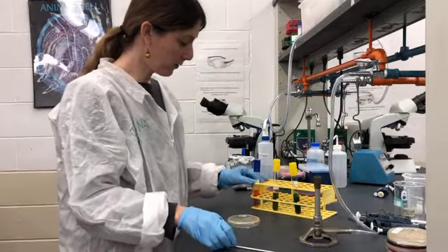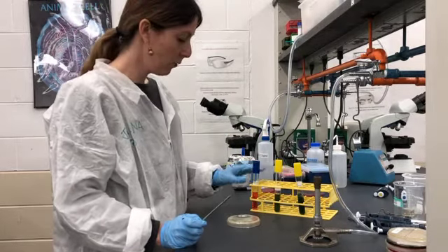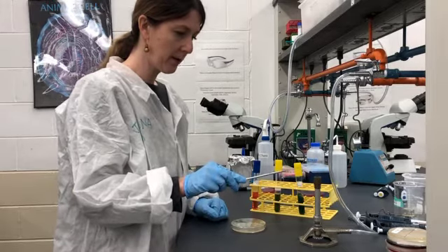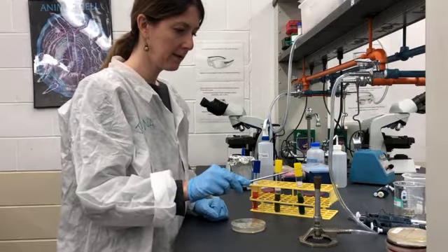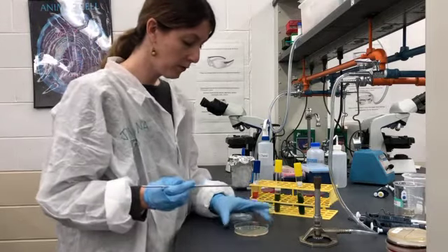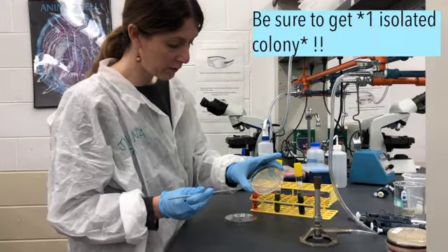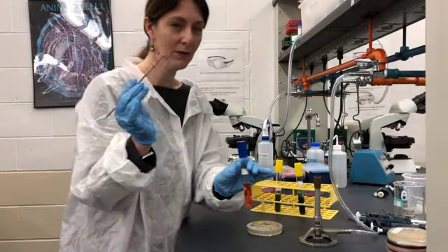So let's start off with the liquid culture. This will be a review for you, but I'm going to show you one kind of best practice when I'm inoculating this tube. So I have my nutrient agar plate that has a streak plate on it. I'm going to flame my loop to collect a colony. Remember that I'm going to want to cool the loop in an area where I see no bacterial growth, and I will collect one colony. I usually like to choose one that's kind of isolated away from other colonies.